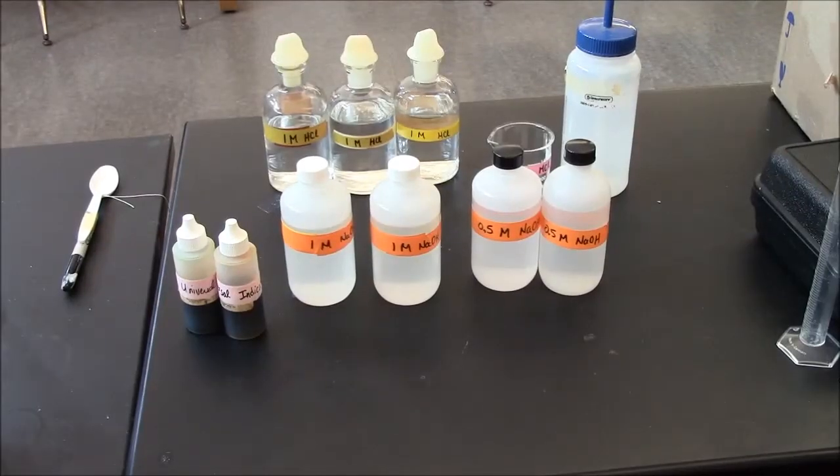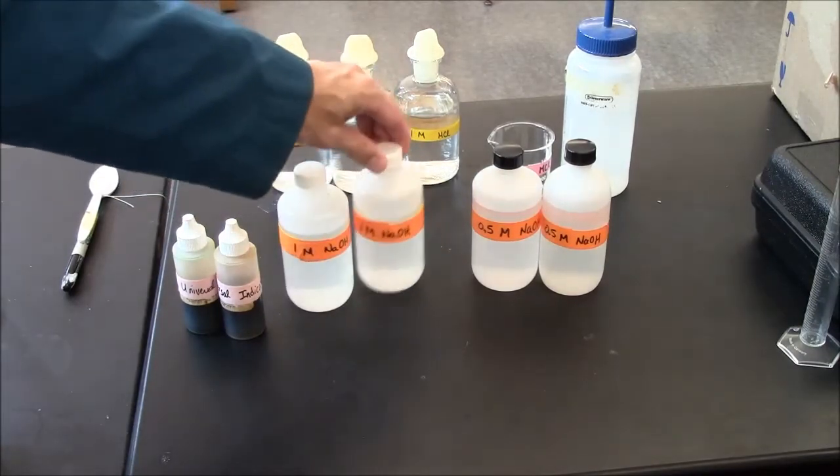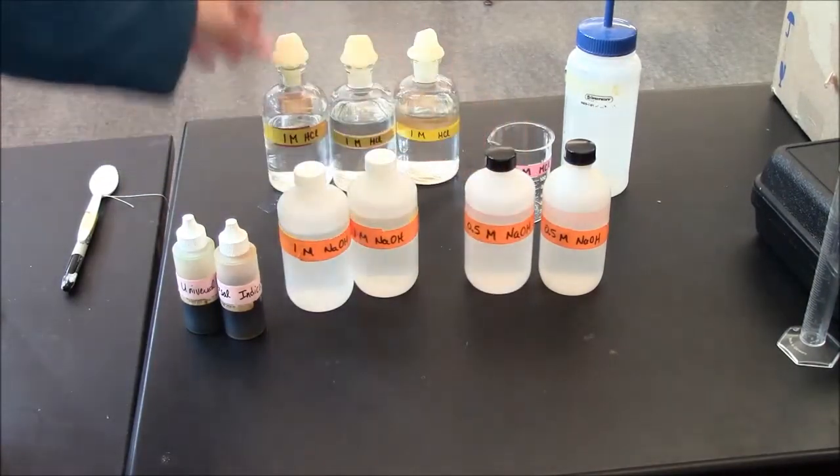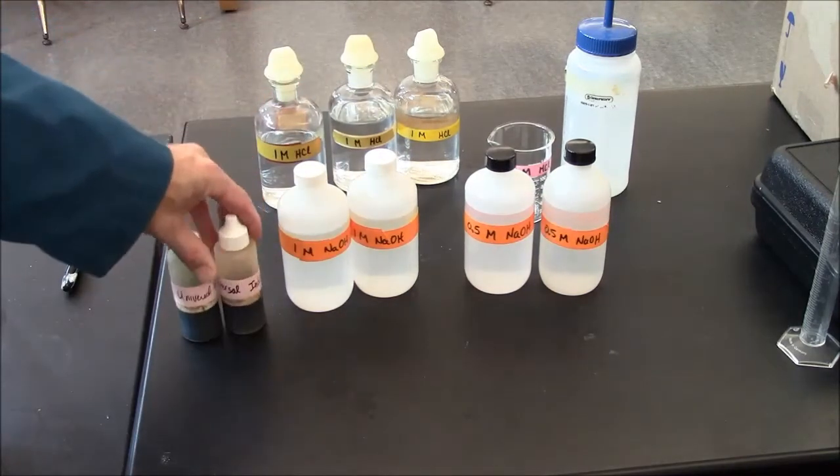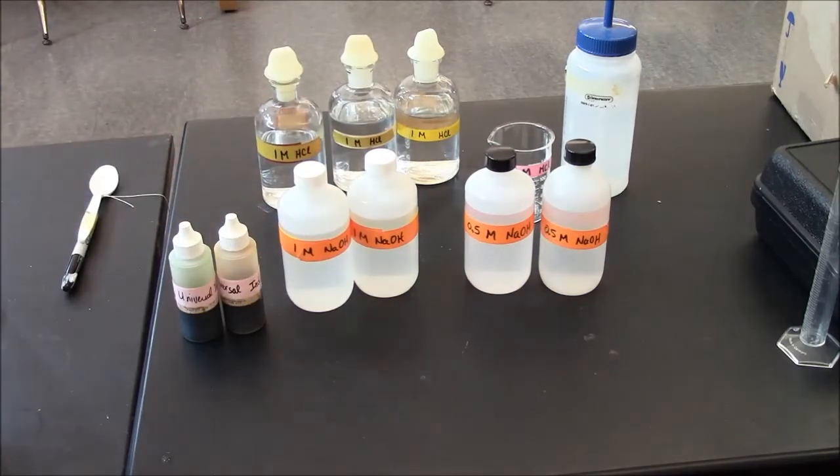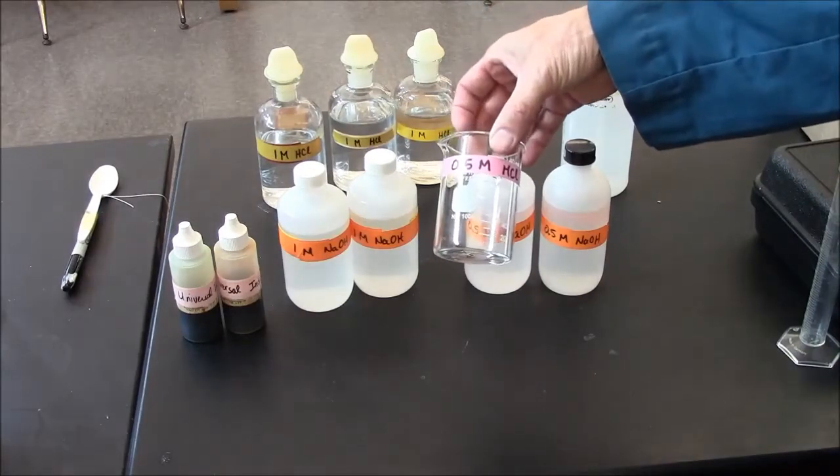When you reach the titration phase of the lab, you'll see I have provided one molar NaOH, half molar NaOH, one molar HCl, and universal indicator. It may be that your instructor asks you to use half molar HCl. I have not provided that on the table, but it's very easy to make.